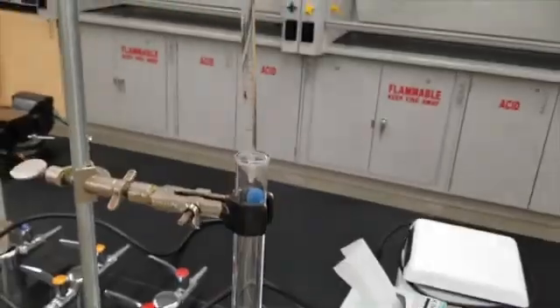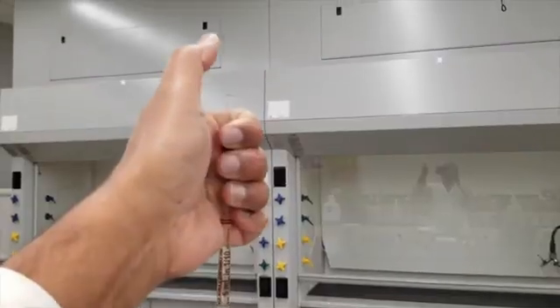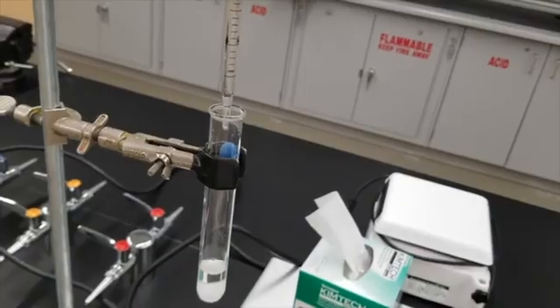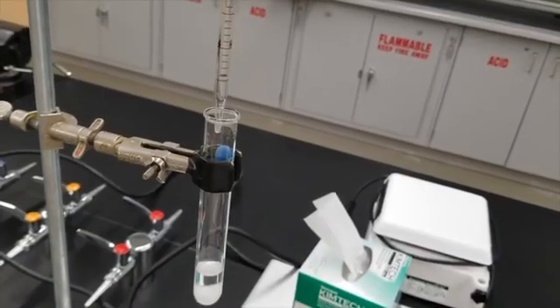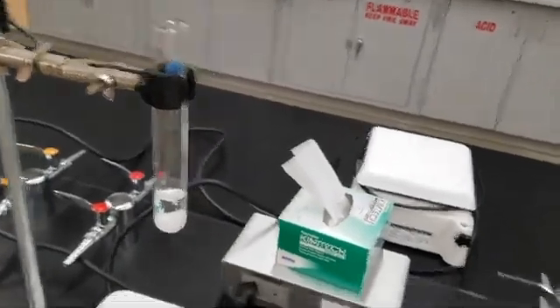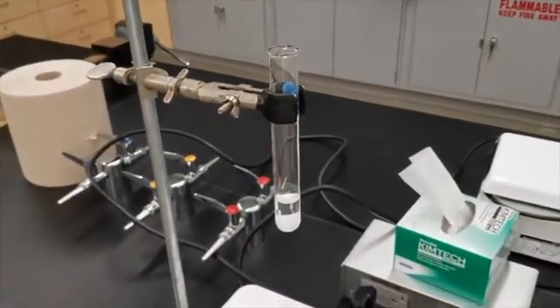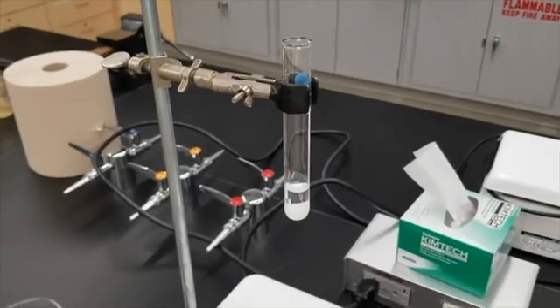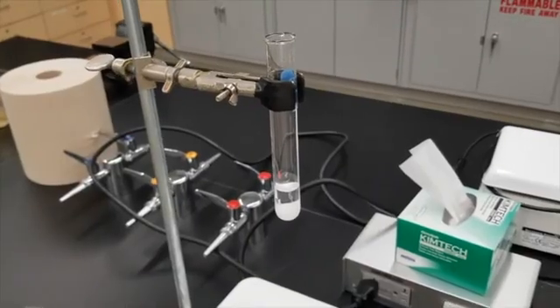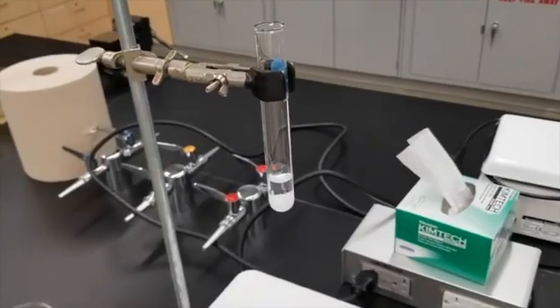which I am now going to add to my potassium nitrate. I'm just going to release my thumb here like that. And you can see all of the water is just draining into my test tube with my potassium nitrate. Okay, so we have 5 milliliters of water now in this test tube, as well as our potassium nitrate that we weighed out. So we're going to put this in a warm water bath and get it to dissolve. All right, so once it's all dissolved, we'll take it out of the warm water bath and go from there.